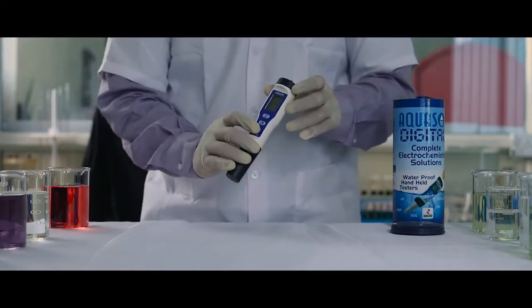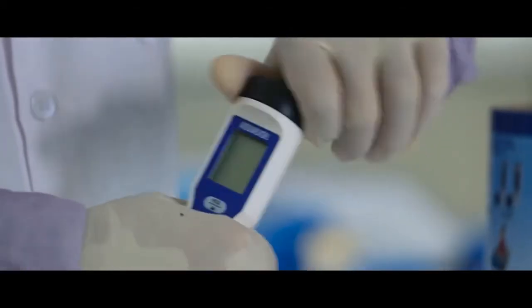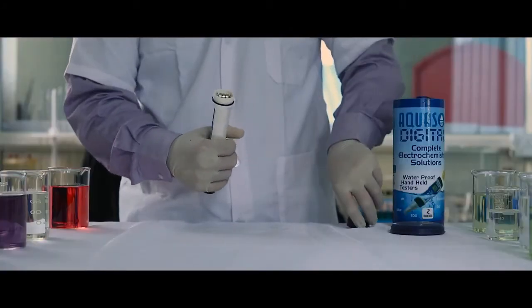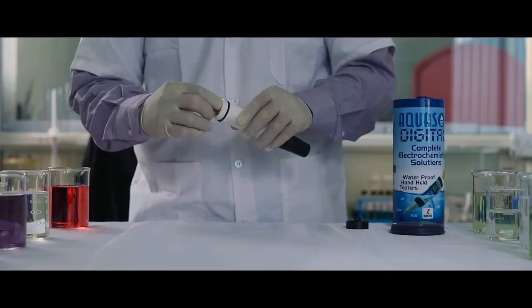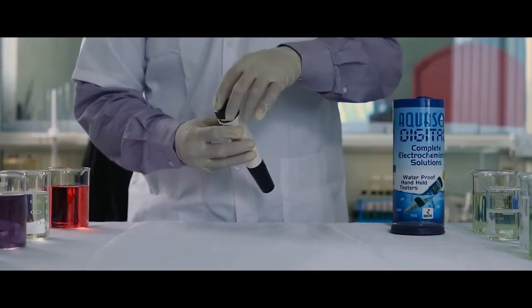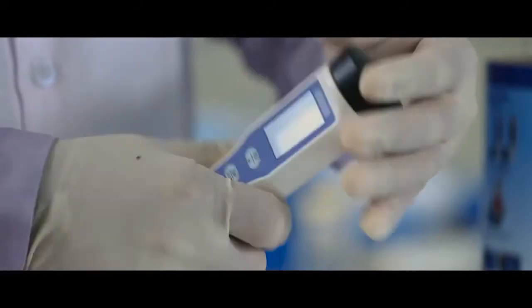To replace the batteries, switch off the meter and unscrew the battery cap on top of the device. Note the polarities and replace the batteries. Screw back the battery cap.